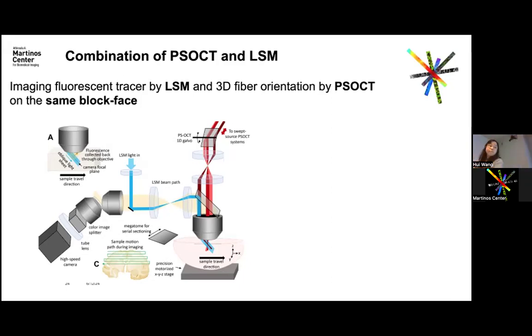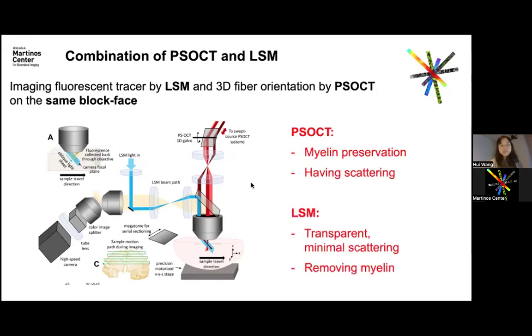They have voxel to voxel correspondence in the end, right? There's no registration needed because they image the same plane and then section it off. I image the same plane again with the two modalities and section it off, and each reconstructed volume is undistorted in 3D, and they have direct correspondence. So the idea is very good, except the two technologies are inherently incompatible.